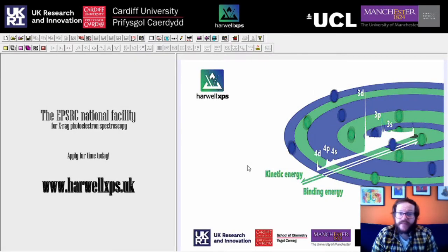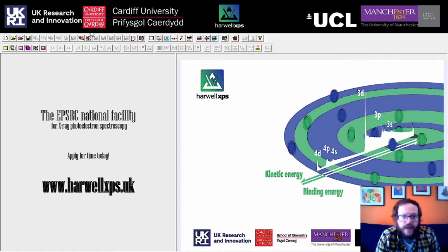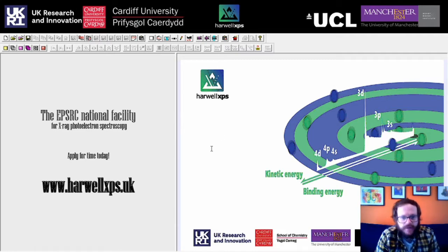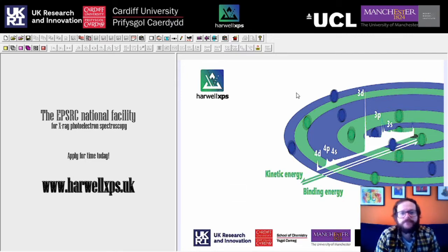Now that we've downloaded CASA, we just need to enter our site license. Open up the software, head on over to Help and About CASA XPS, and you can enter your details here — the username and license — and then just click Update License. And then you're all set.